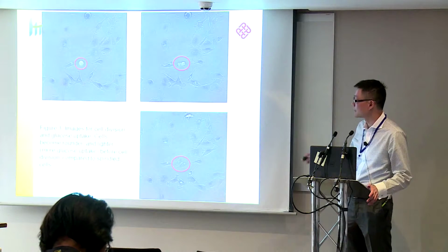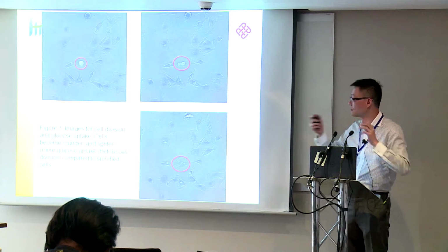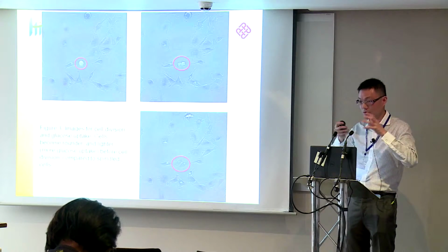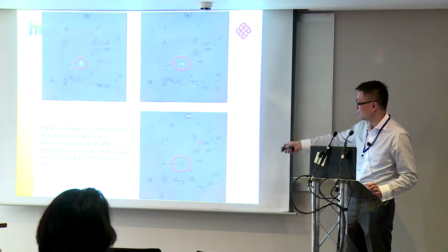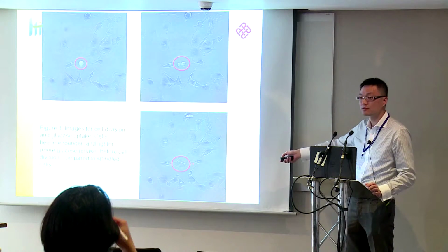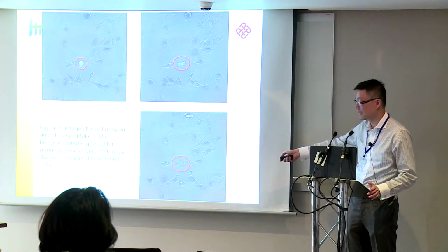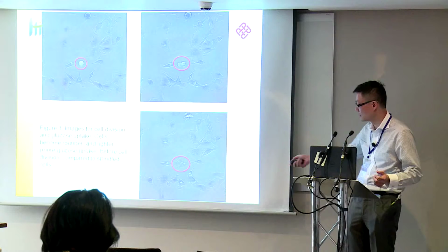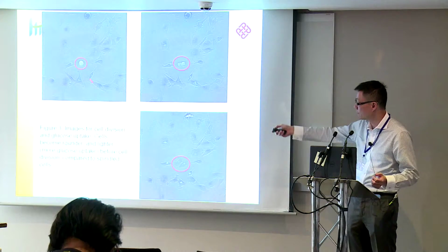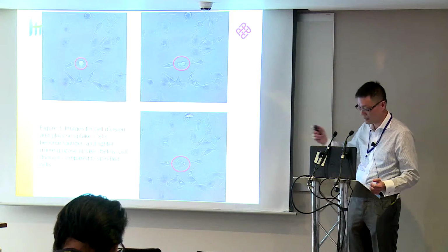And this is one example of the cell division. The cell becomes rounded, takes up a lot of glucose, and then divides into 2, and becomes spindle shape after the cell division. And you also see the light become darker. They use up a lot of glucose during the cell division. Compared with before the cell division, which is a very bright color, it becomes lighter.